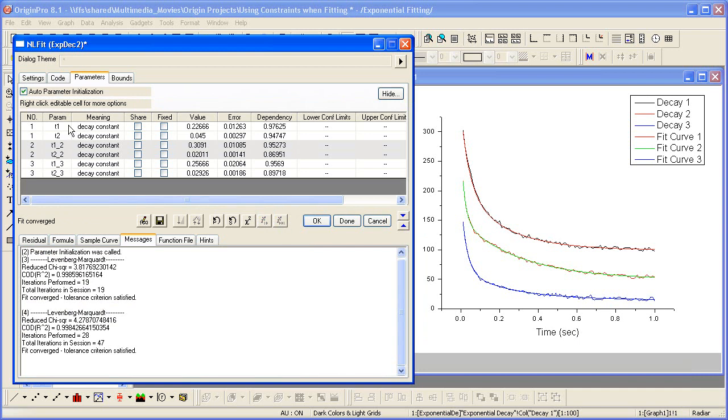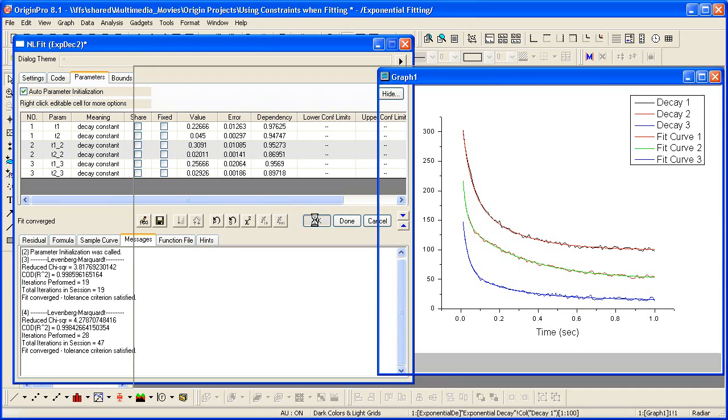So all our T1 parameters are indeed greater than 0.2, and the T2s are less than or equal to the 0.045 value. Let me click OK to accept these results.